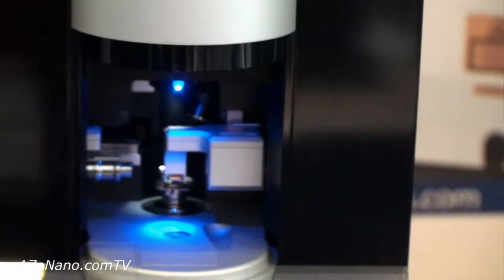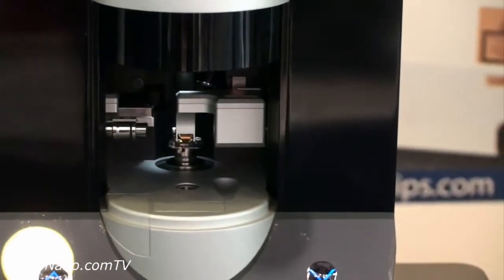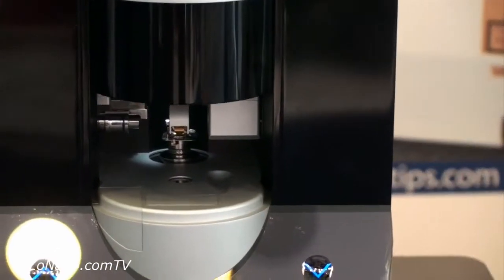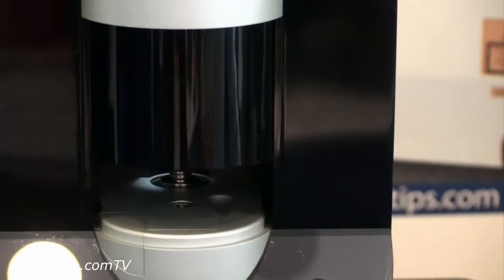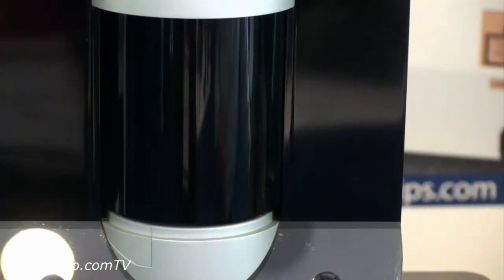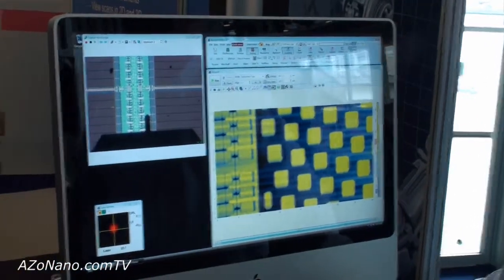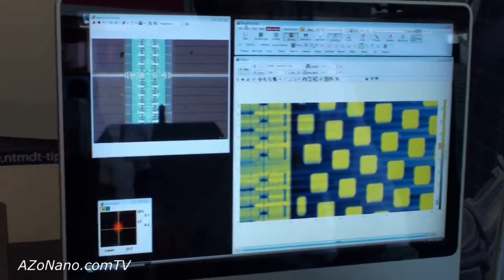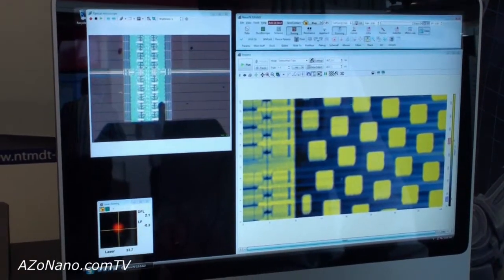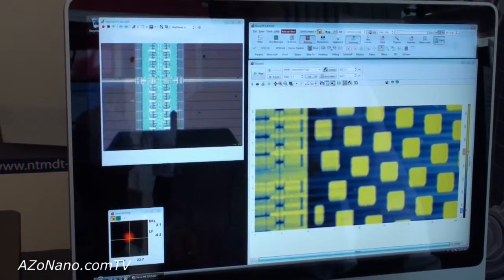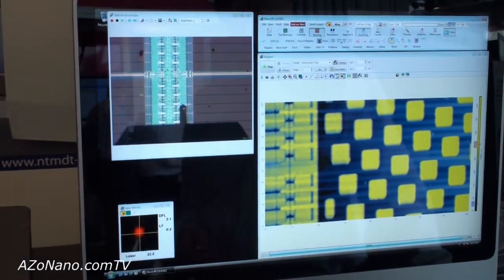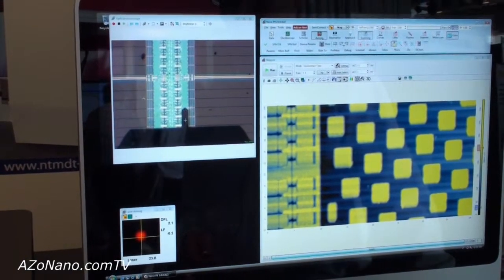I'll close the door. After you put the sample in the instrument and put the cantilever, you don't actually need to do anything else. Everything else is controlled from the software. This is the main control software of the system, and here is the optical video microscope where you can see the sample underneath the AFM cantilever with its tip.